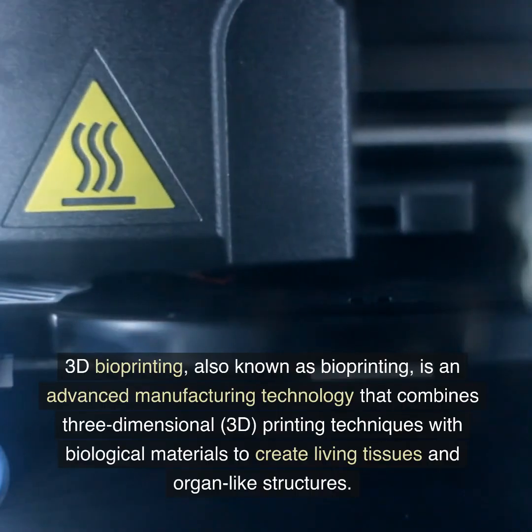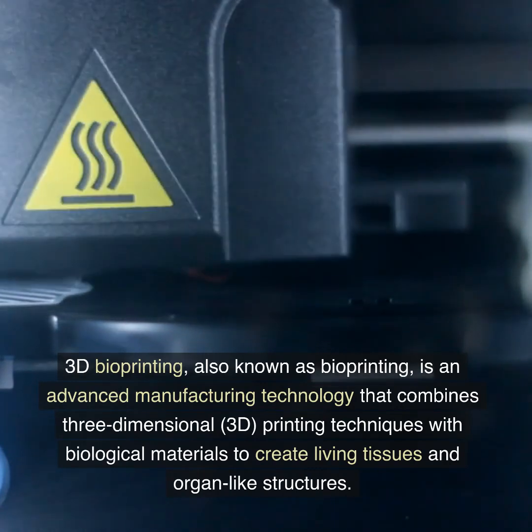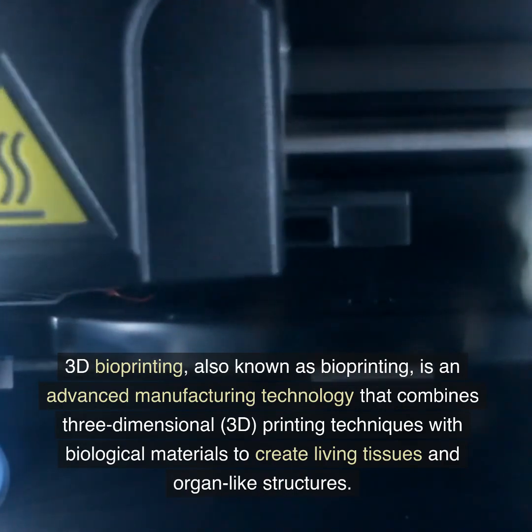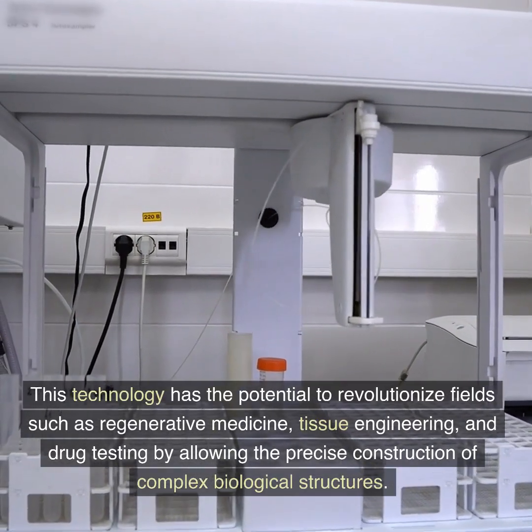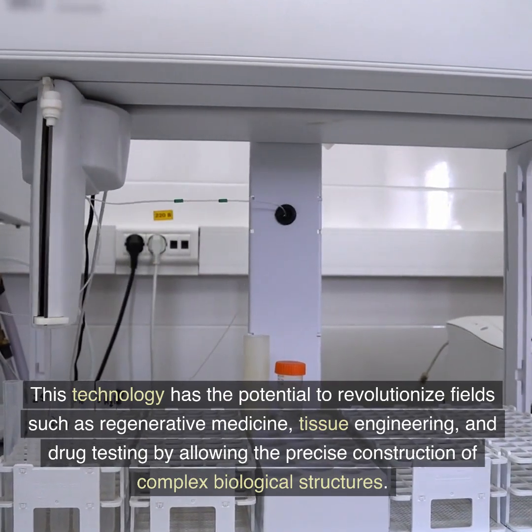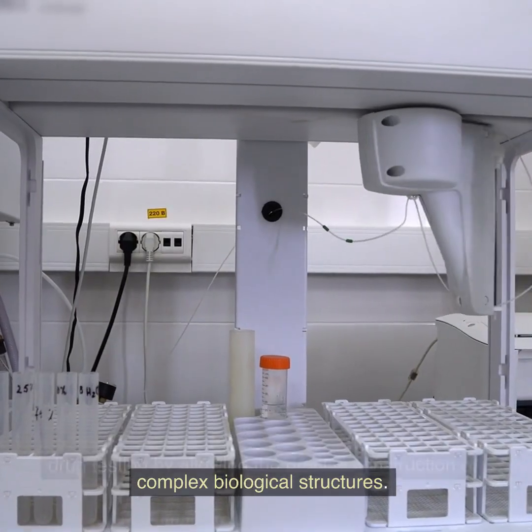3D bioprinting, also known as bioprinting, is an advanced manufacturing technology that combines three-dimensional (3D) printing techniques with biological materials to create living tissues and organ-like structures. This technology has the potential to revolutionize fields such as regenerative medicine, tissue engineering, and drug testing by allowing the precise construction of complex biological structures.